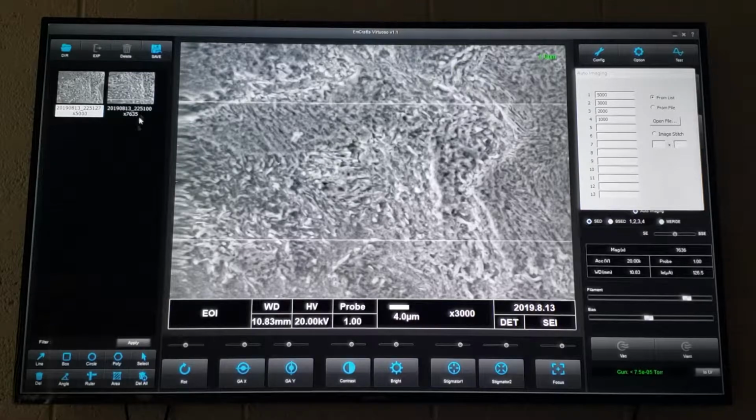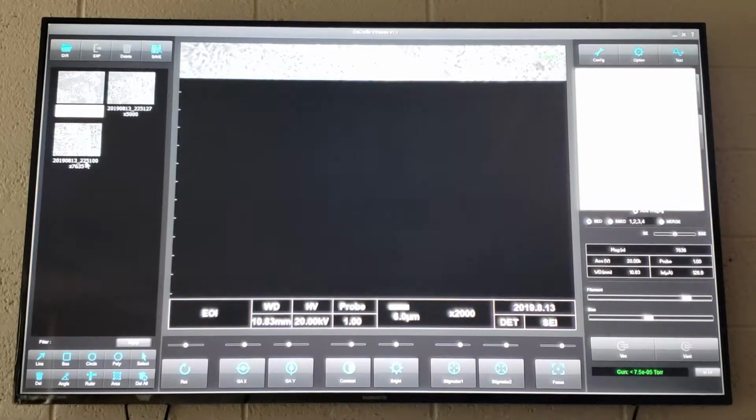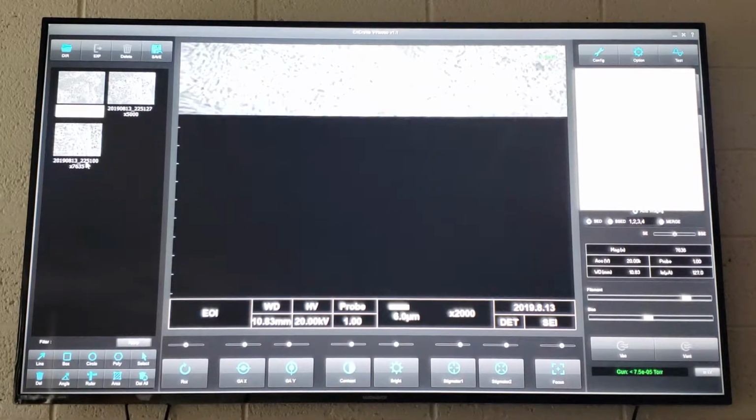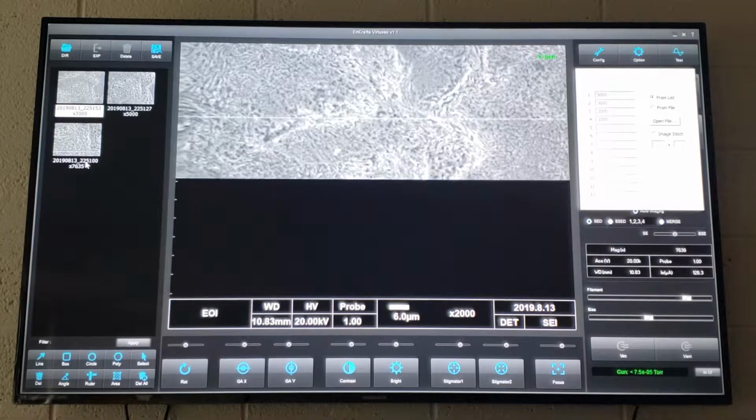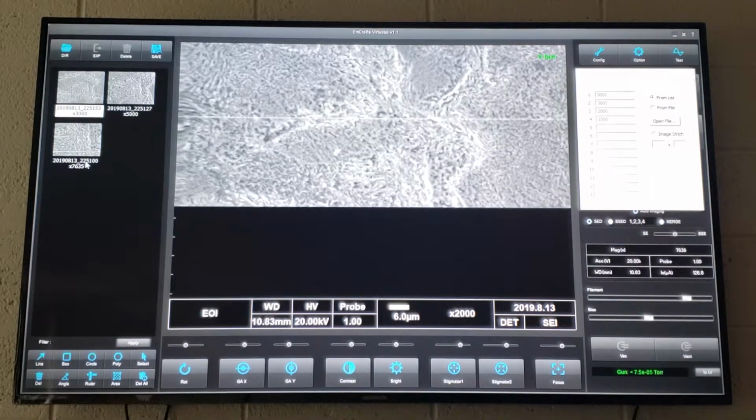And it's saving everything in that directory, right? The image directory. Yeah. So that's where it's throwing everything. You get X 5,000, X 3,000. Yep. Now it's doing its next one. Is that a special directory other than the one that was there? No, that's the same directory. I cleared that whole directory. I reset the whole thing. Yep, so it's just going through the job I gave it.